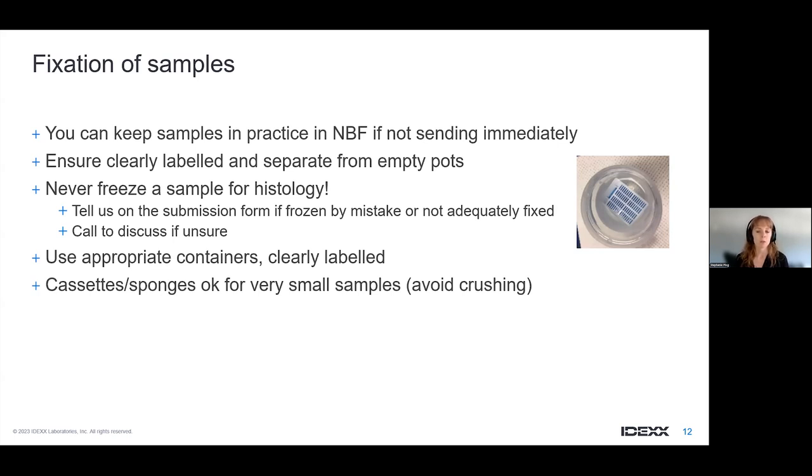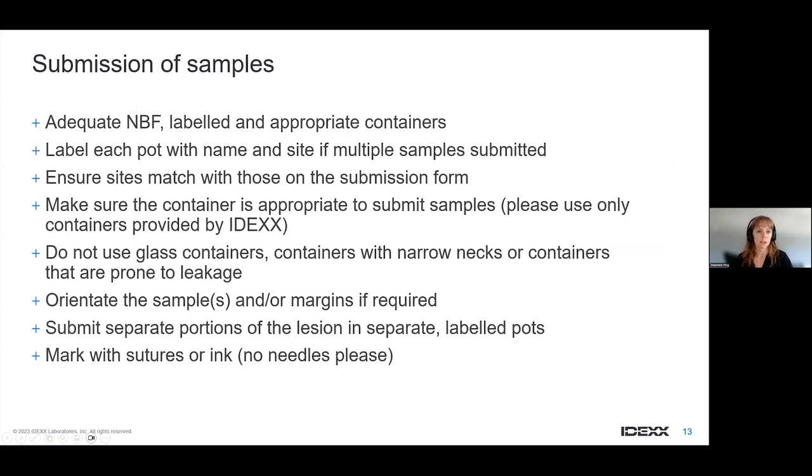The only thing to be careful with these is to avoid any crushing, so not to press the cassette down on the sample. Yeah, I've already touched on that. We need labeled and appropriate containers. And if you submit multiple samples from the same patient, then it is important to label each pot with the name and the site where you've taken the sample from as well.